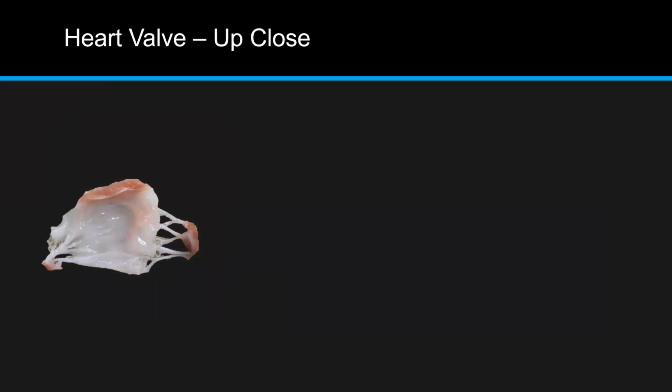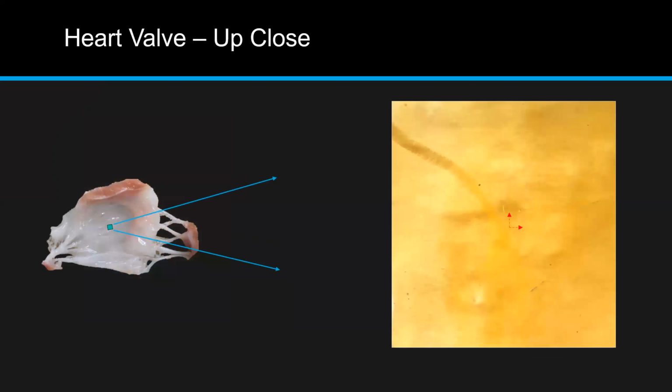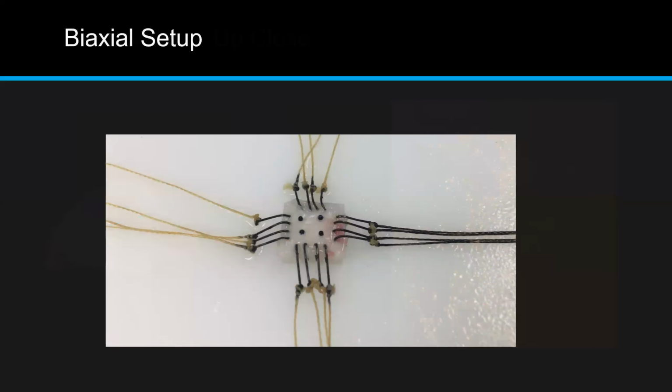Here is an isolated heart valve that was dissected. Although hard to see, a pattern of small fibers appear horizontally. Not much structure is obvious going in a vertical direction. In our experimental approach, we trim the tissue to a smaller size and attach hooks and surface markers, which we can then track to quantify tissue deformation. We then proceed to mount it and stretch. Because of the present anisotropy of the specimen, a biaxial tensile machine is a great tool to use.